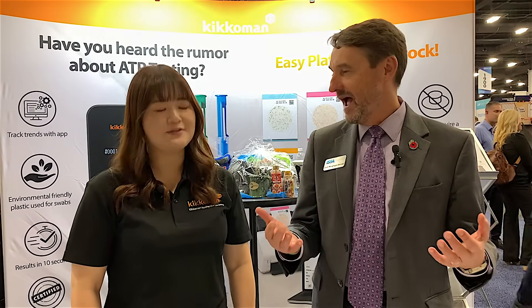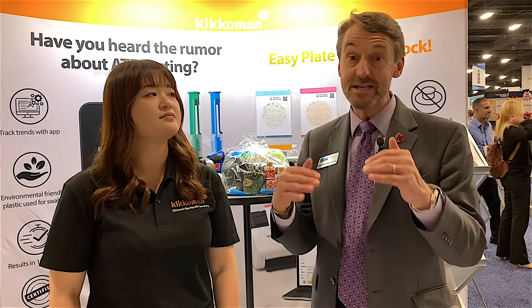And that's a great point, Alyssa. This is about being professional. This is about being effective. Don't get caught up in the numbers — look at your pre-clean number, look at your post-clean number, those numbers should be different. And then, yes, if you're in certain areas or buildings where we need to aim for a specific below-threshold number, that's what your cleaning processes should achieve. But more importantly, just show that how you clean actually removes pollutants, contaminants, microorganisms, germs, soils — the whole thing. Make sure you measure.